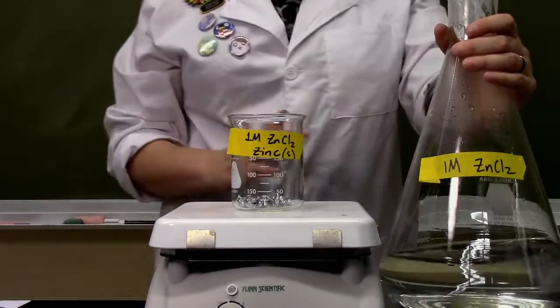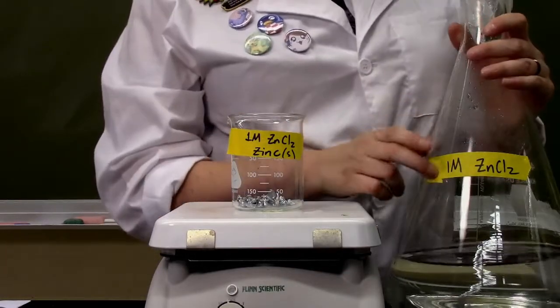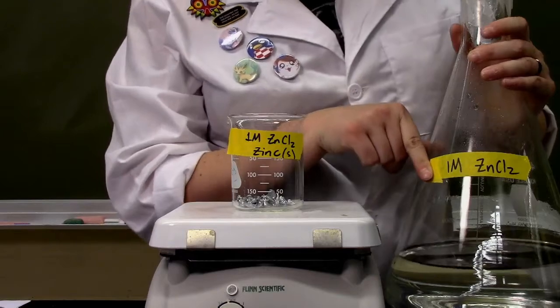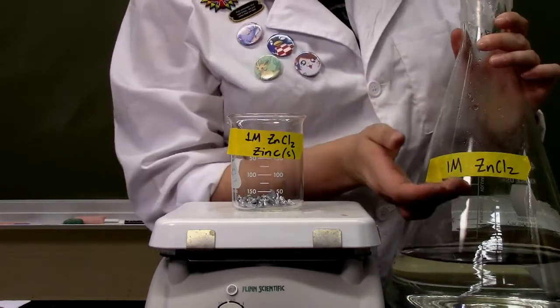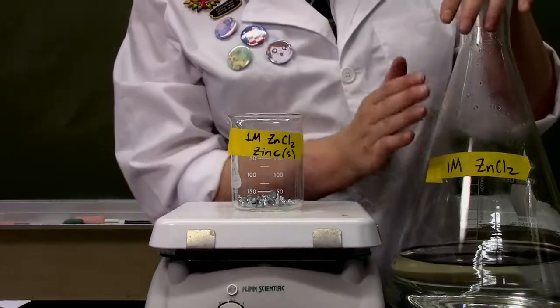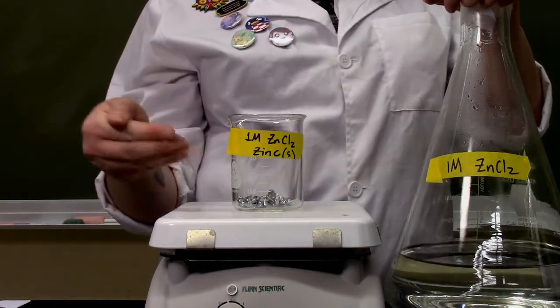Next up, I will be adding this pre-prepared solution of 1 molar zinc chloride. Now, I know we haven't gotten to this type of descriptor yet, but 1 molar is just a unit of concentration. So in chemistry terms, this is just saying how concentrated this zinc chloride liquid is. Now, I've already pre-prepared this, and I'm going to measure out 50 milliliters of it and add it to my beaker.